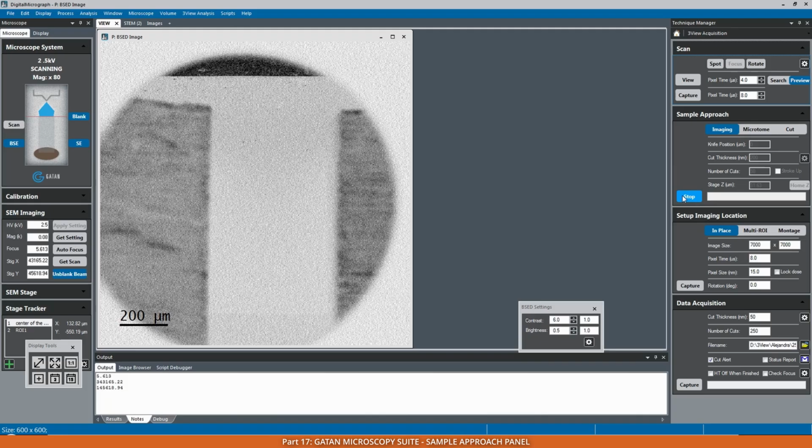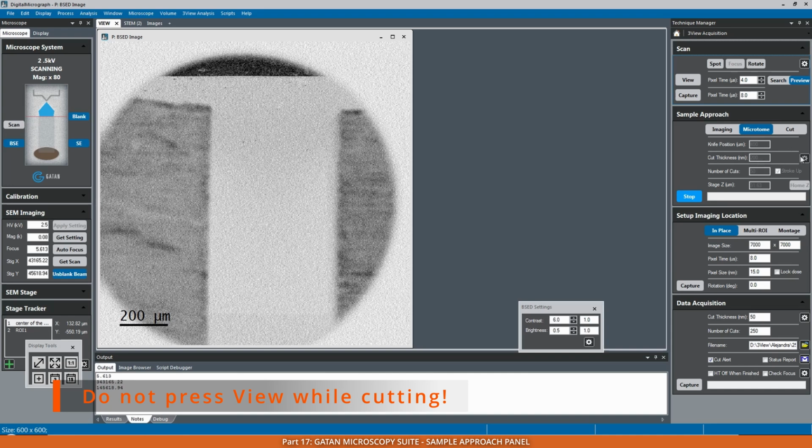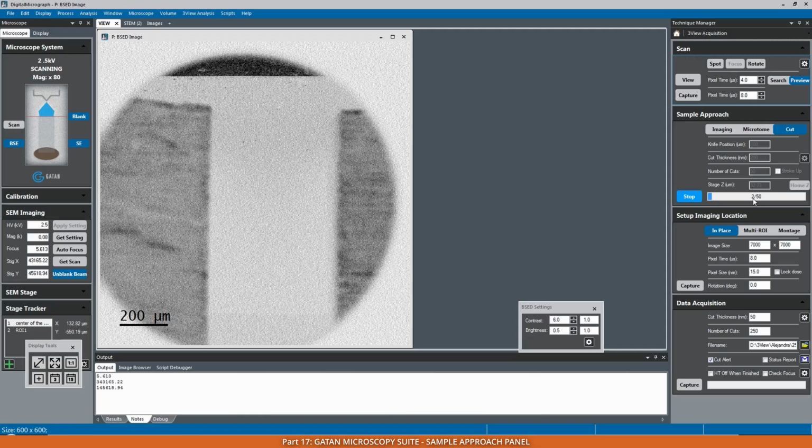When I press start, the knife will be making the cuts with a step of 200 nanometers, and it will use these parameters that I specified here. While the knife cuts, you can see its position in this dialog, and in total you have this progress bar. So out of the number of cuts that we specified, 50, we cut now 2, and now 3 cuts.